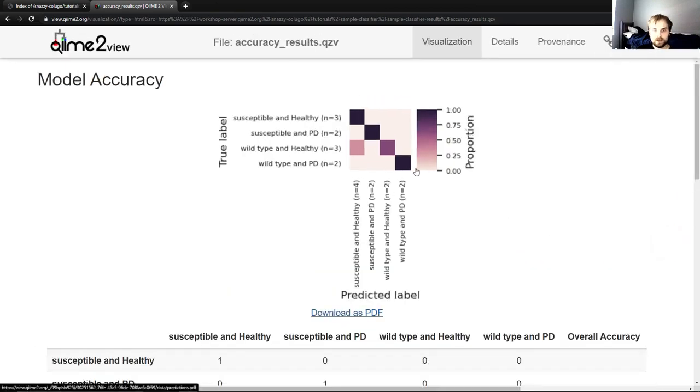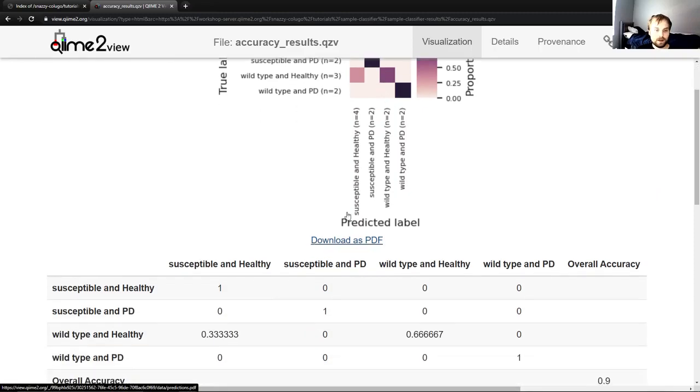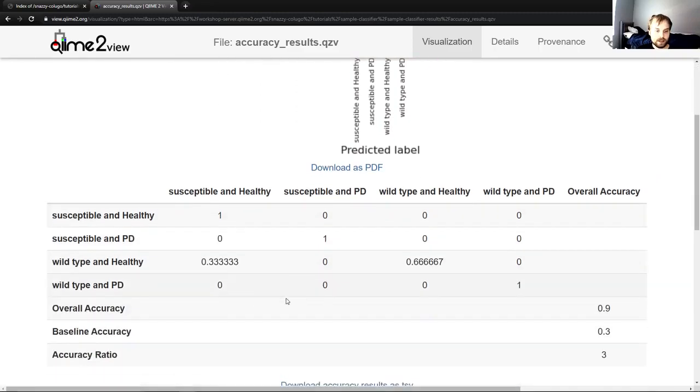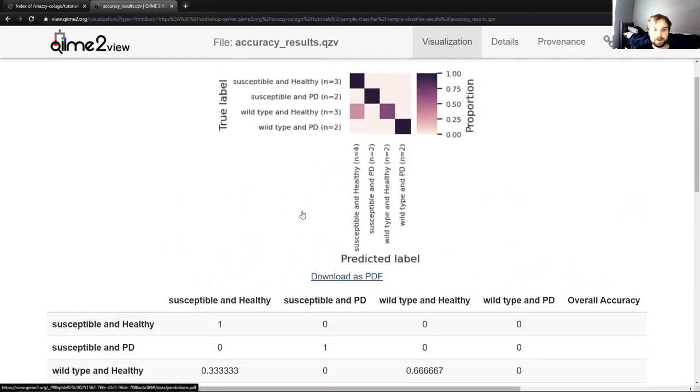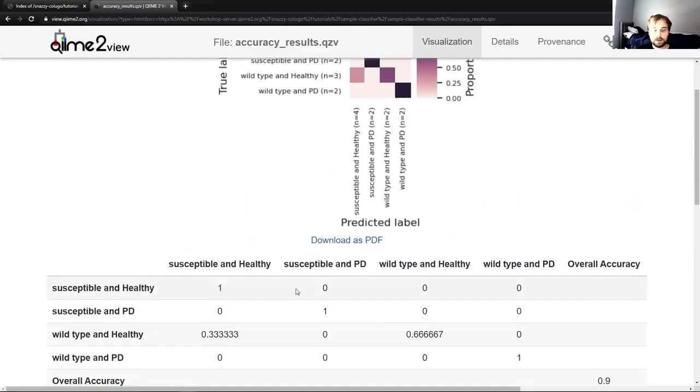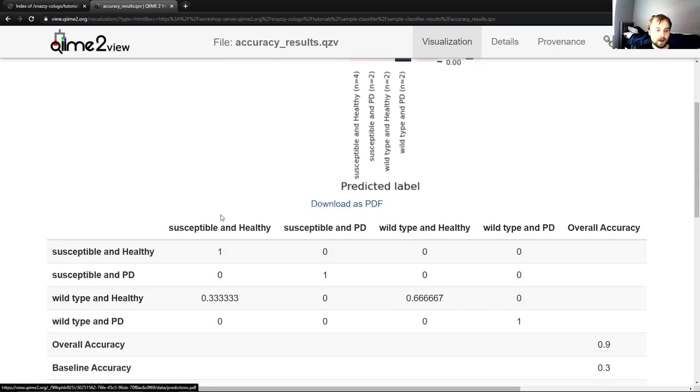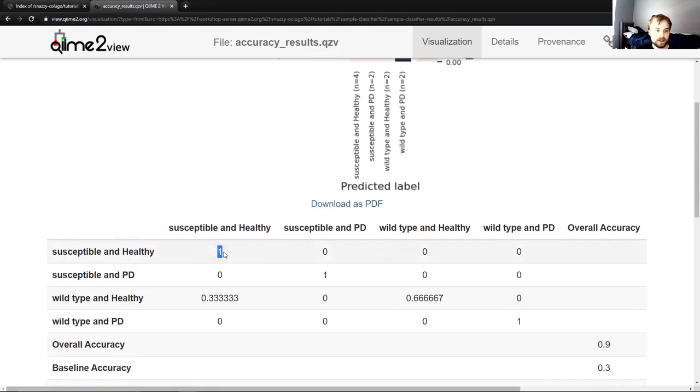What does this mean? This table down here does a good job of explaining it to people who aren't familiar with these heat maps. So we'll start here and then we'll look back up at this. So what this means down here is that we classified 100% of susceptible and healthy mice as susceptible and healthy mice, which is correct.